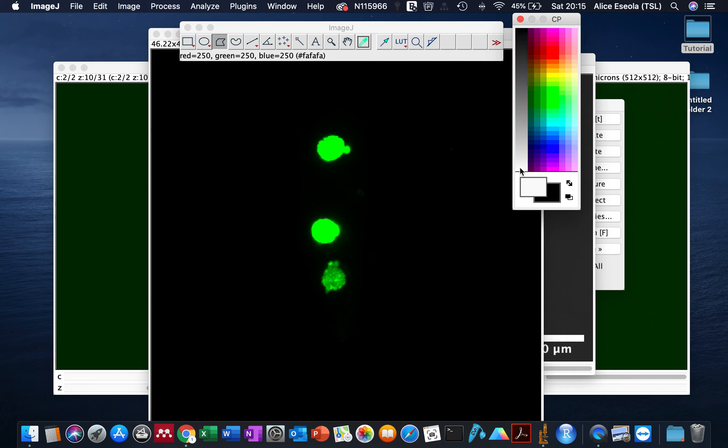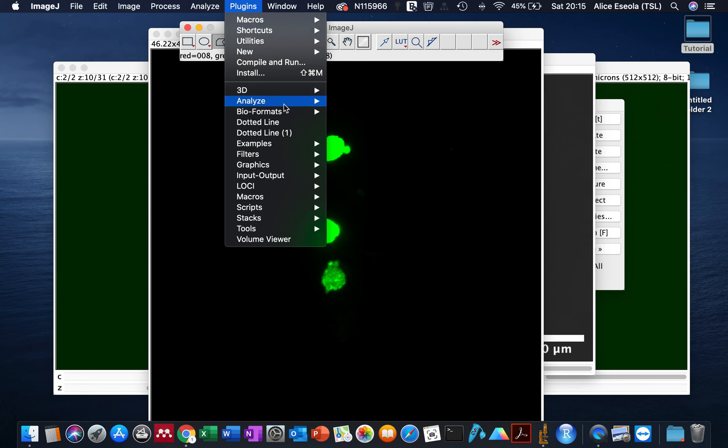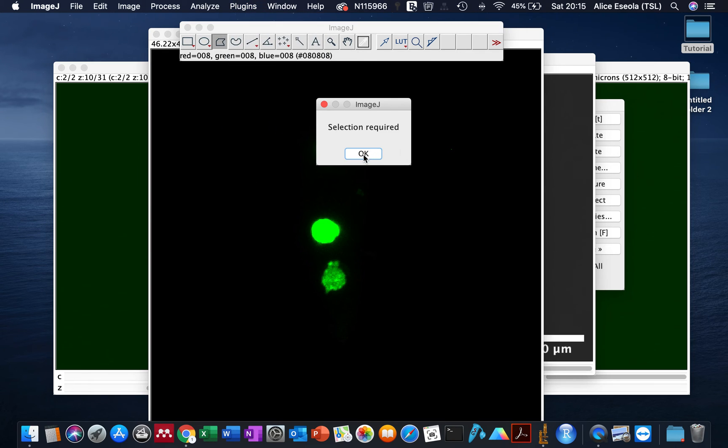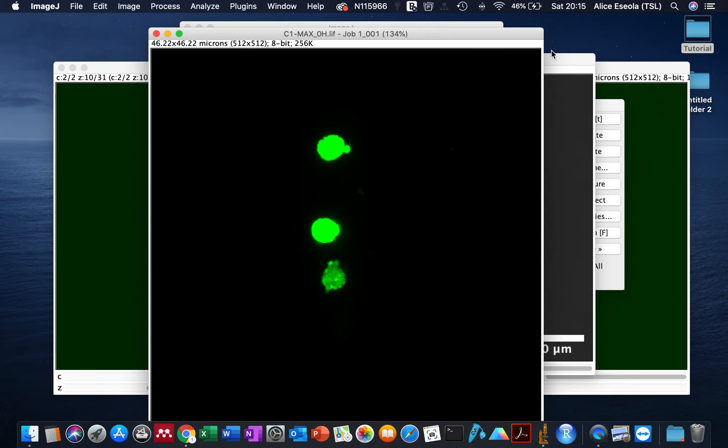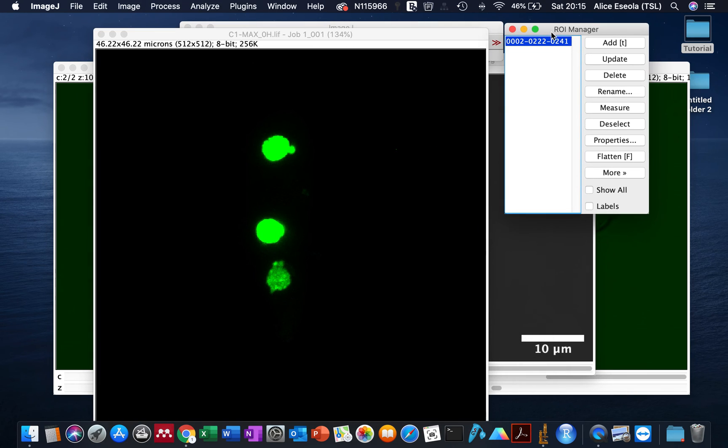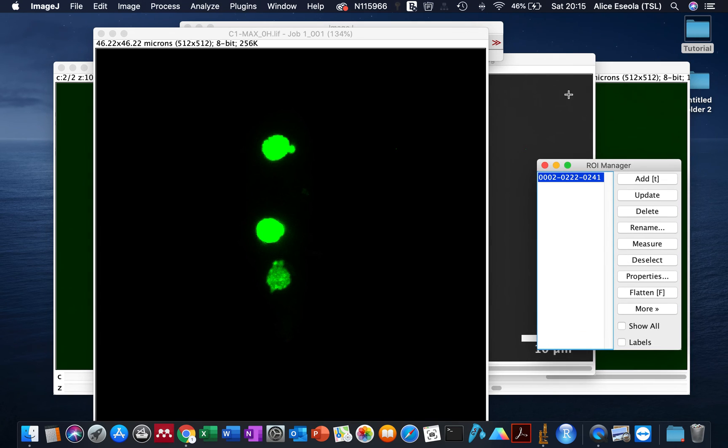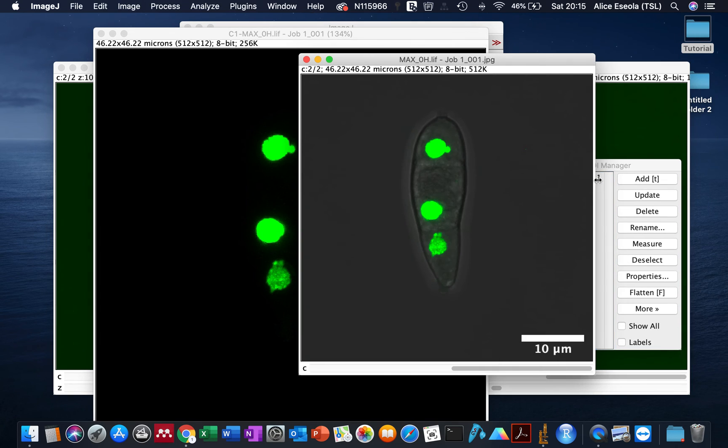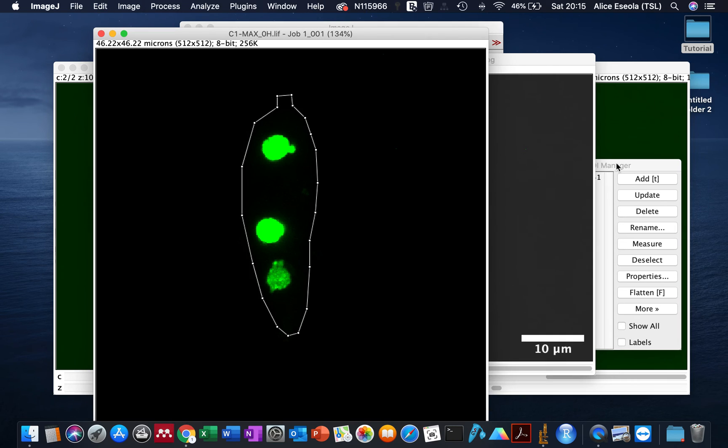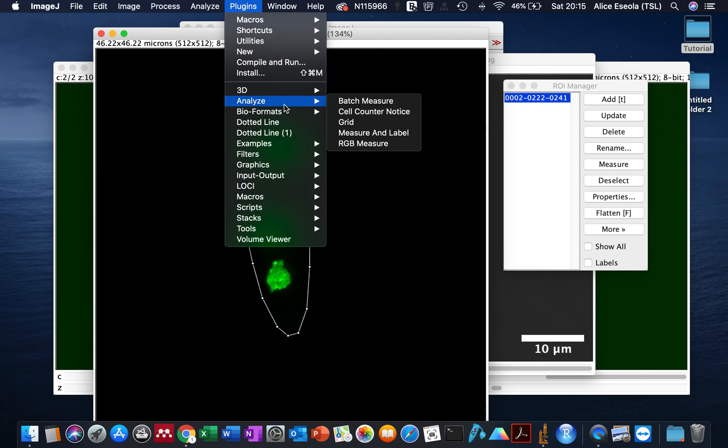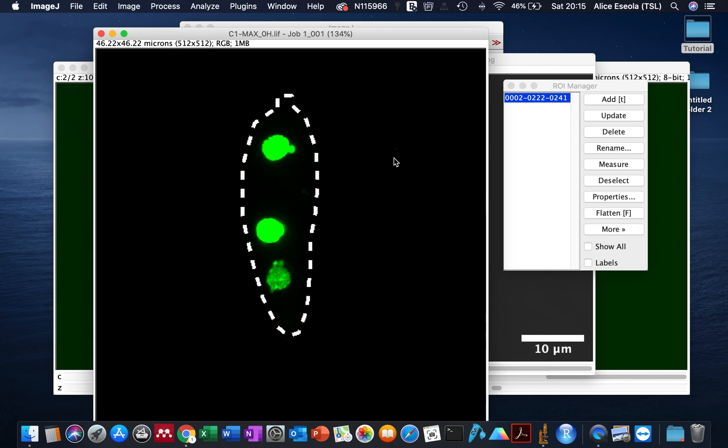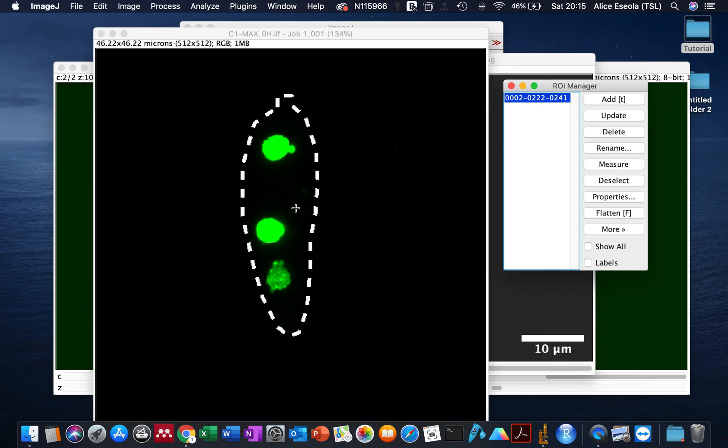With that, we just go back to the plugin and select dotted line. Oh, I've lost my outline, so I just click on the ROI manager to get back my outline. Now I have it. I click Control-E to paste that outline back on this image. Then we go to Dotted Line, click OK, and see we have a sketched outline as white.